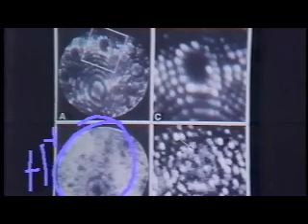All right? So a field ion microscope image is not clean. That's the first thing that I'm telling you. There's always hydrogen around, and it's always there, but it's invisible in the field ion image. And in fact, helium binds to the surface as well. You can, of course, image with it by popping it off, but it'll only show you the high field regions where it binds.